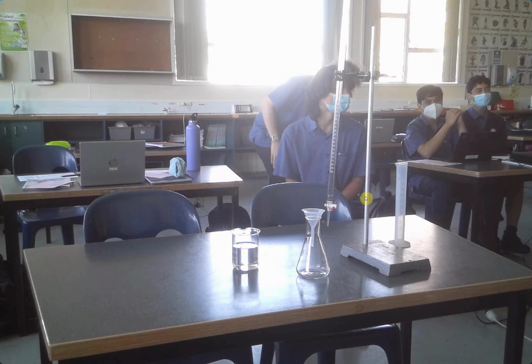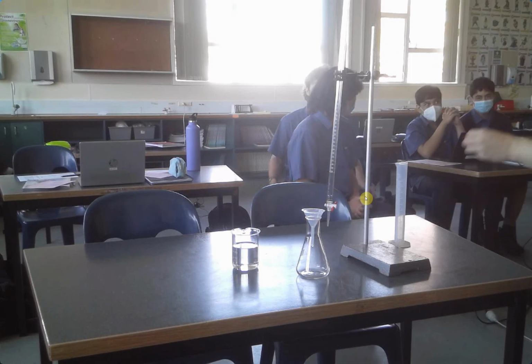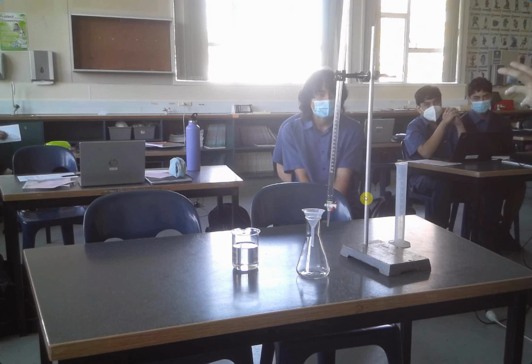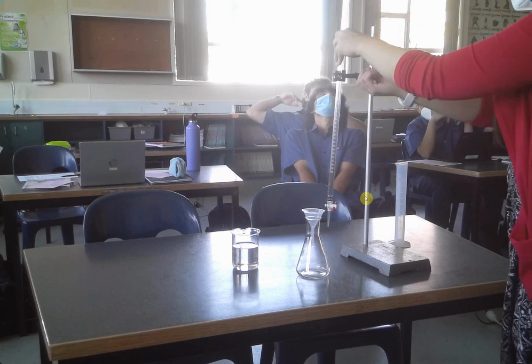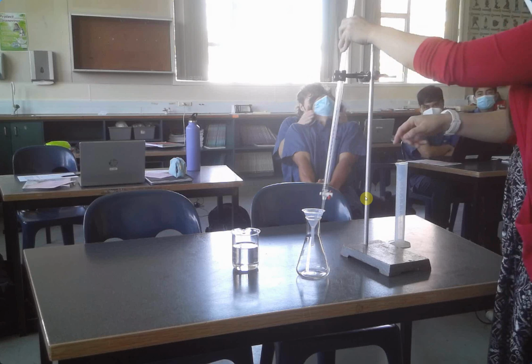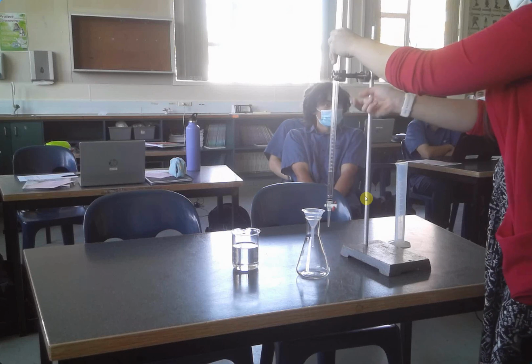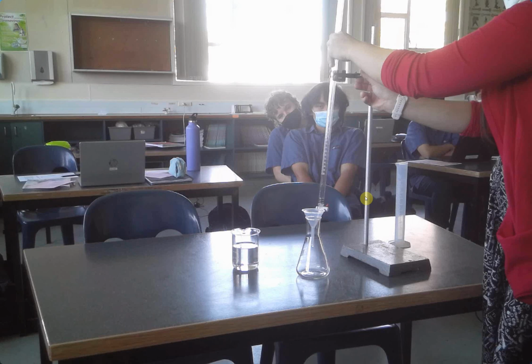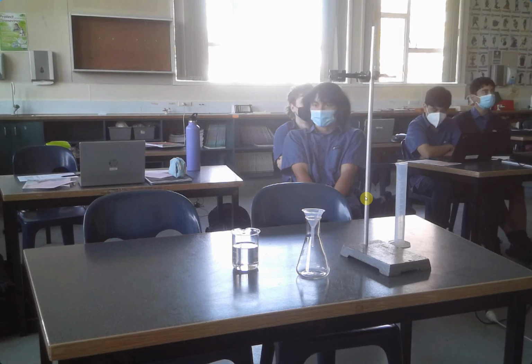I just want to show you guys some of the titration equipment so you are aware of what you're doing and why you do it. Let me get this removed so you can see the whole thing. This here is our clamp stand. This is what we're going to be attaching our burette with.